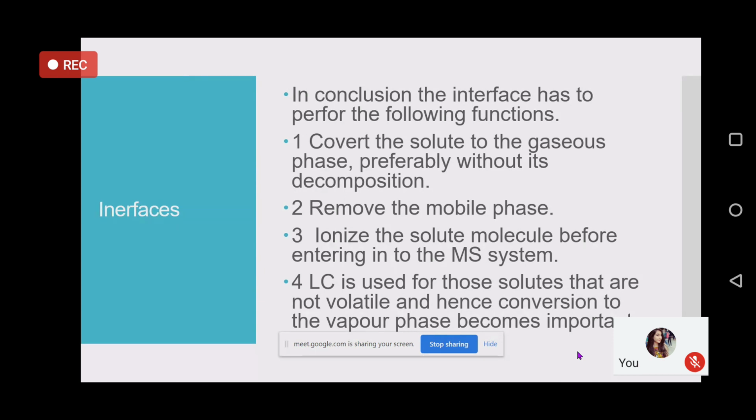Unless the structural isomers, like the geometric or the steric isomers, are able to produce different fragments which can be used to identify the original type of isomer. Otherwise, it is not possible. Detection will be possible with mass spectrometry provided the fragmentation pattern of the two isomers differs, geometrical isomers as well as other types of isomers.